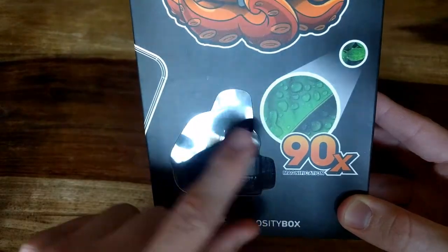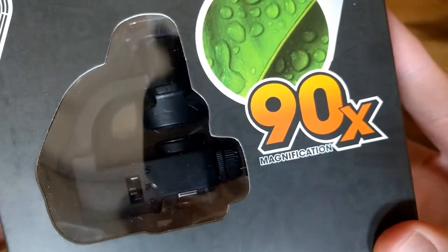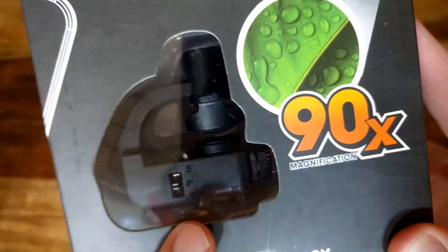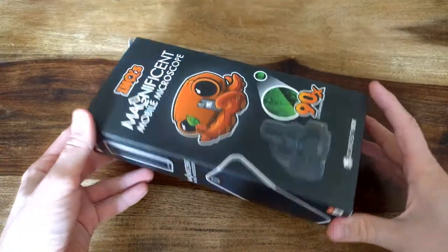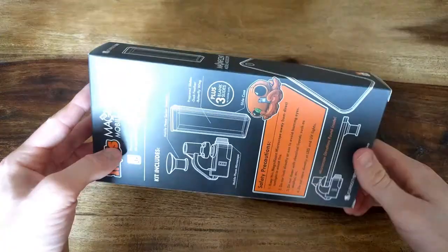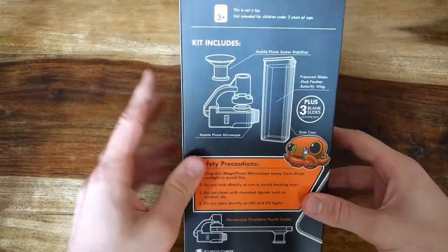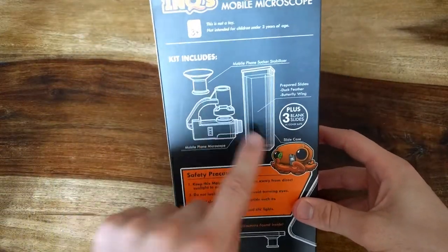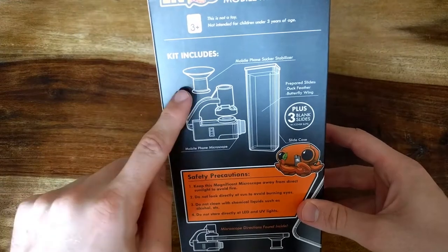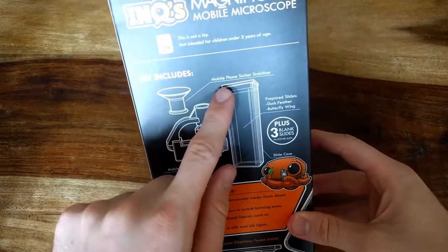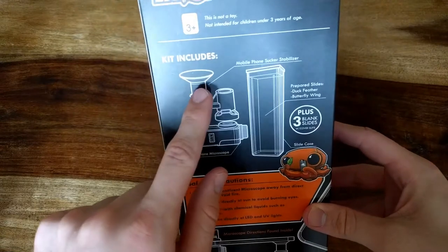This is actually the microscope itself. The package, as you can see, it's pretty cool, and it includes three pieces. This is the microscope itself, this is the mobile phone sucker stabilizer, and I'll show you later what it does.